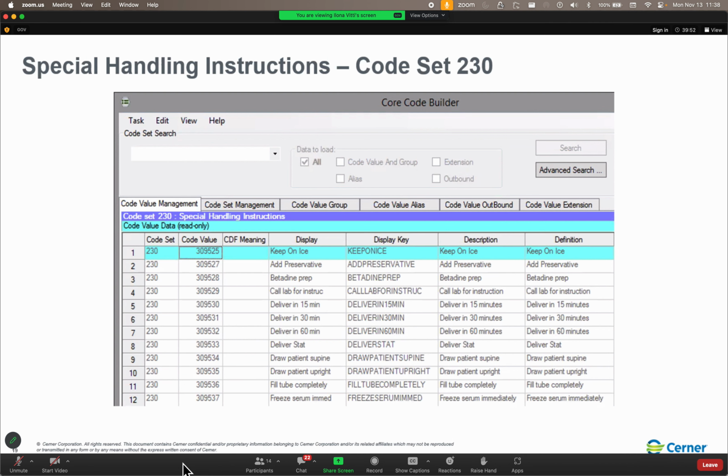And if you go to just the straight set of specimen management reference pages, you can do a search out here for site prefix or just the word site and see what comes back in your search. Like maintain Oracle Health Specimen Management accession number modifications. There we go.